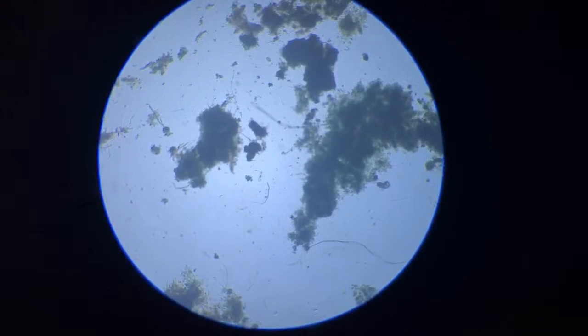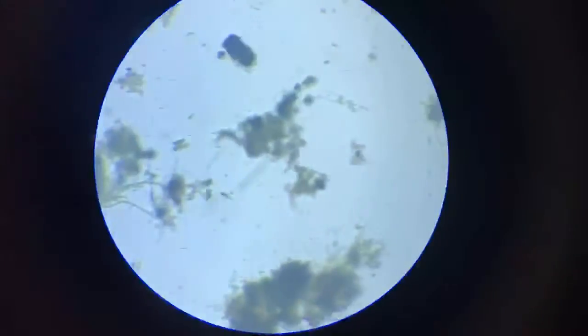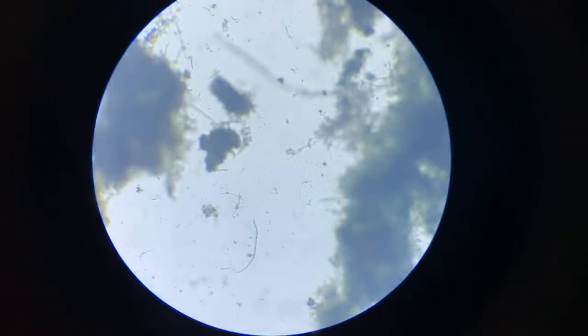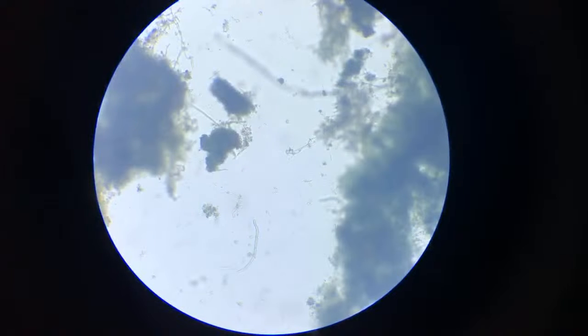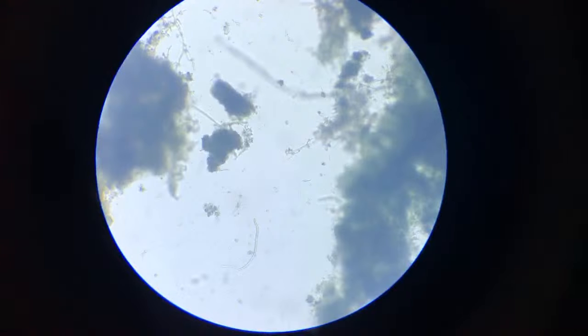So now I'll proceed to 100x and try to find any worm here. Search for any worm, but there isn't any visible.